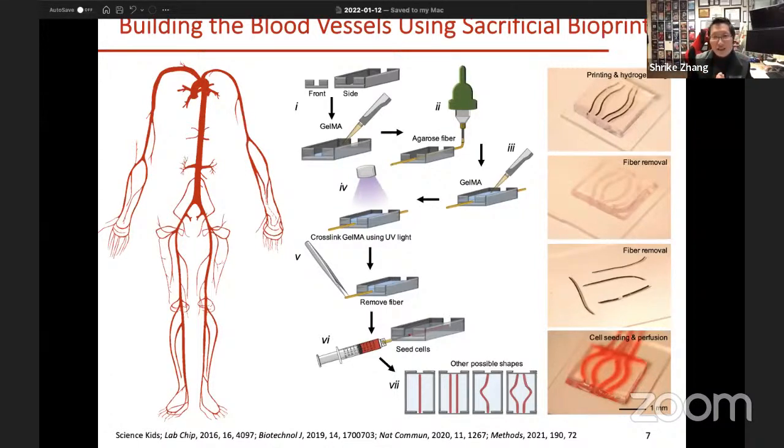After that, you cross-link this matrix, and once it is cross-linked and stabilized, you can selectively remove the initially bioprinted template from the hydrogel matrix, eventually creating a hollow perfusable microchannel within the surrounding hydrogel to allow emulation of hollow tissues like the vasculature.